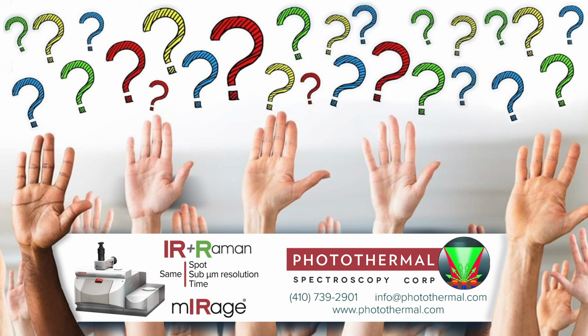Well, the spectral resolution was comparable with the Raman option of the OPTIR system. So there are 3 different gratings: 300, 600, and 1,200 lines per millimeter. And I used the middle one, the 600 lines per millimeter, and the spectral resolution was in the range of 5 to 6 wave numbers, which is similar to the spectral resolution of the standalone Raman system from Kaiser.